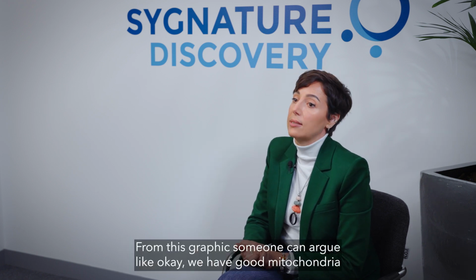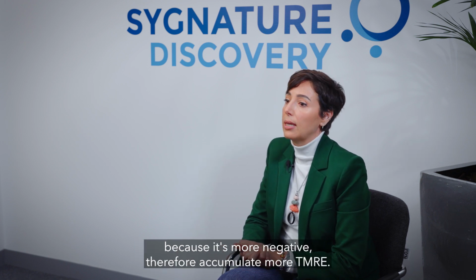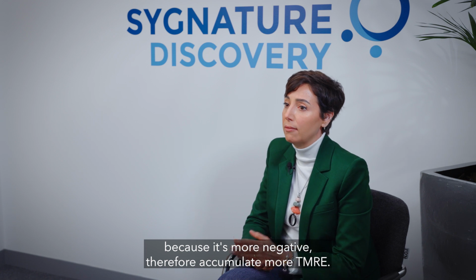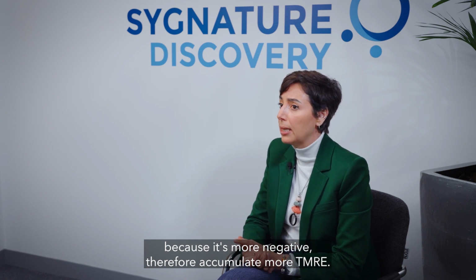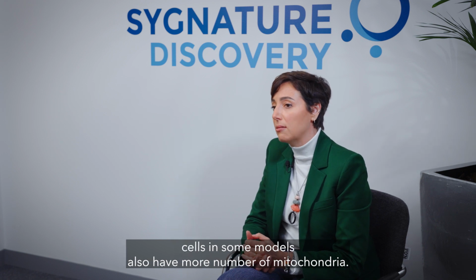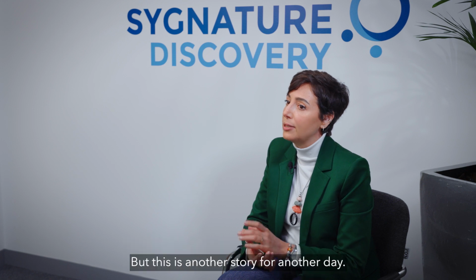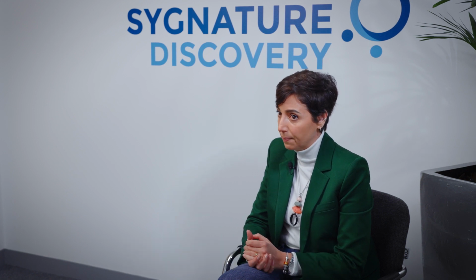From this graphic, someone can argue, okay, we have good mitochondria because it's more negative, therefore accumulated more TMRE. But it's not the case, because we do know that Parkinson's cells in some models also have more mitochondria. But this is another story for another day.